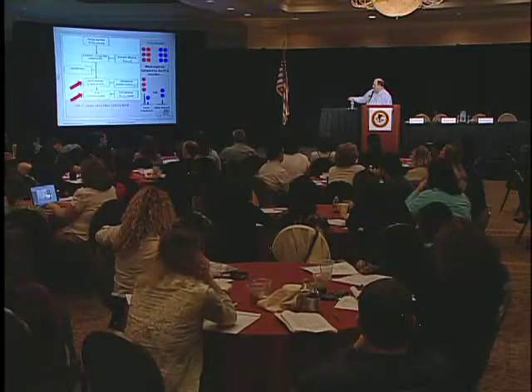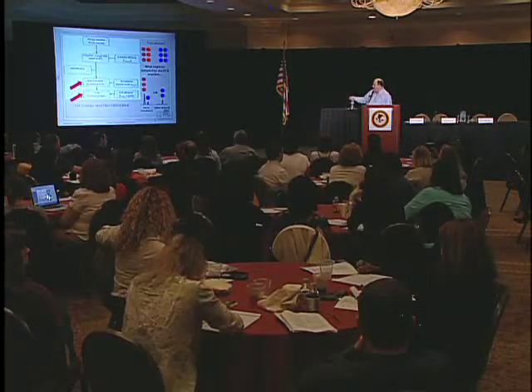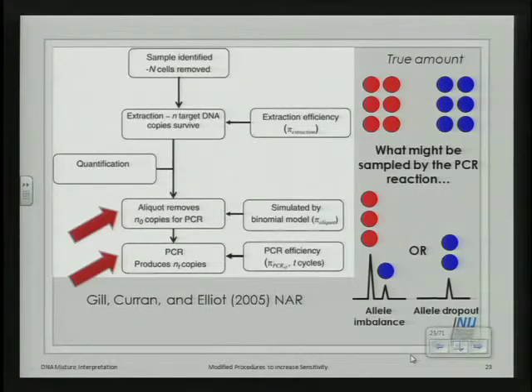In other words, you may have pulled out 3 alleles and 1 allele, but by the random PCR process, you may amplify the 3, and the 1 gets amplified, but not enough to produce a signal. You have to amplify it sufficiently so that it creates a little peak on your electrophoregram. So at 28 cycles, the peak may be below your noise, so to speak, so it doesn't cross that threshold to where you visualize it.